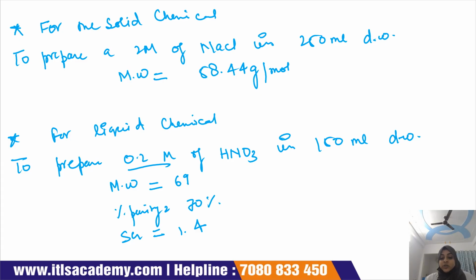Now the next is normality, or a normal solution.